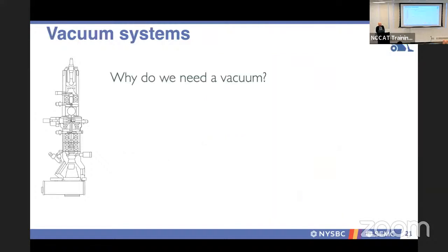So that's a little bit about our sources. And now I'm going to shift gears to talk about vacuums. Everyone has heard that you need a very good vacuum, and if you have a vacuum crash, that delays your session. But why would we need a vacuum?